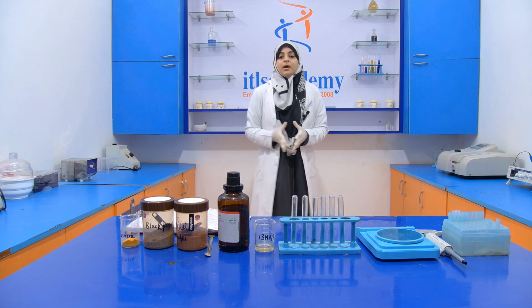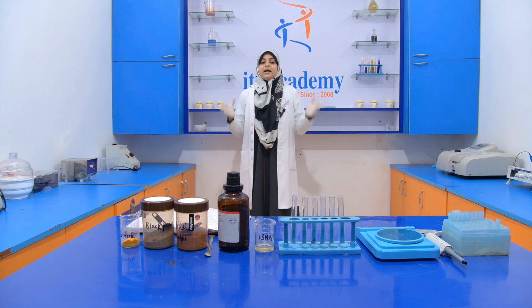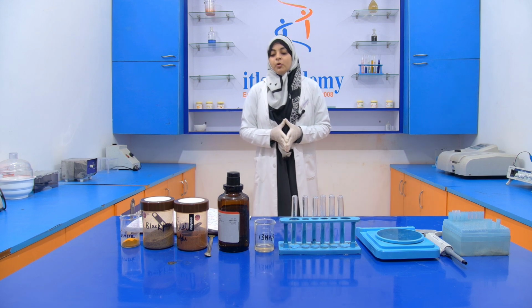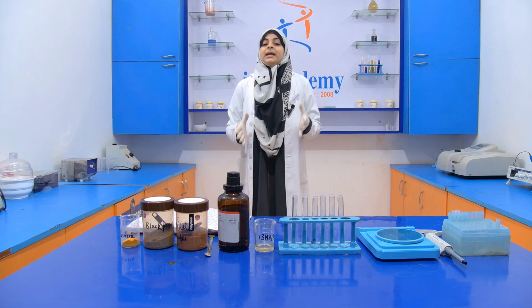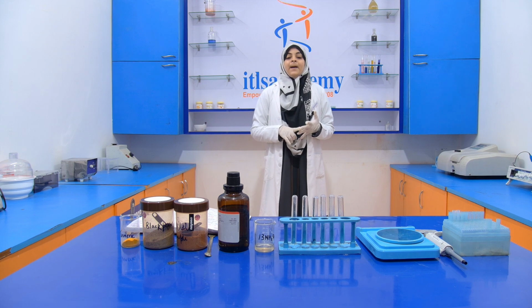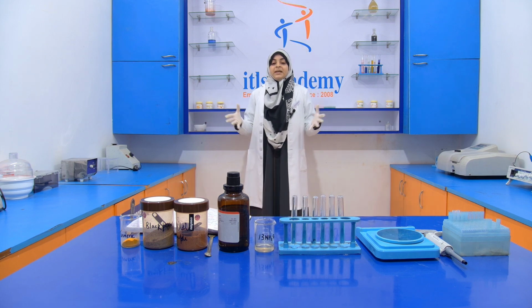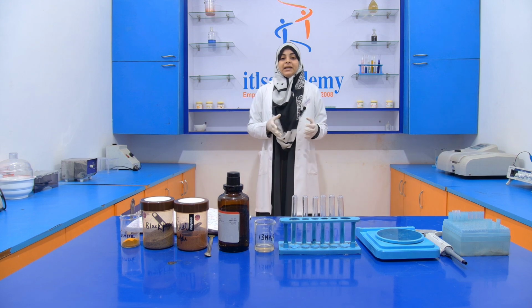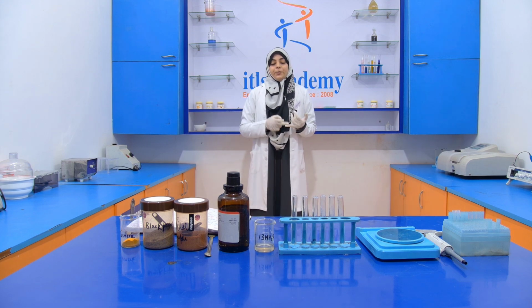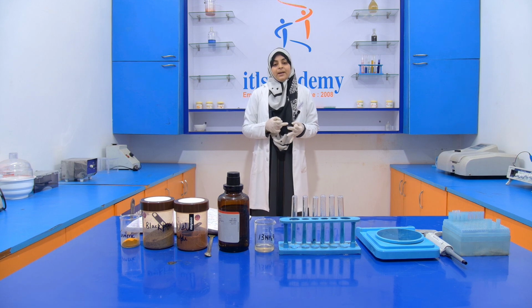Today we are going to discuss another experiment, that is the detection of added color in red chili, turmeric and black pepper. Okay, you can choose other spices also, but here we take three samples, that is your red chili, turmeric and black pepper.